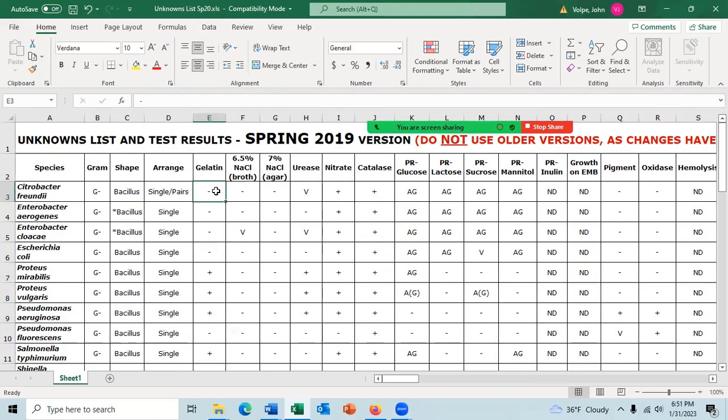The negative ones are ones that do not have gelatin hydrolysis. So if you were to run the gelatin test, the gelatin would remain solid. If the bacteria has gelatin hydrolysis, then they'll be positive in the gelatin test and the gelatin will turn liquid.